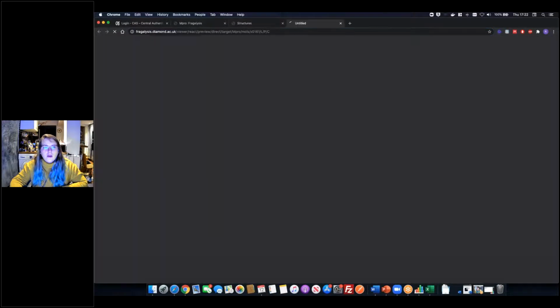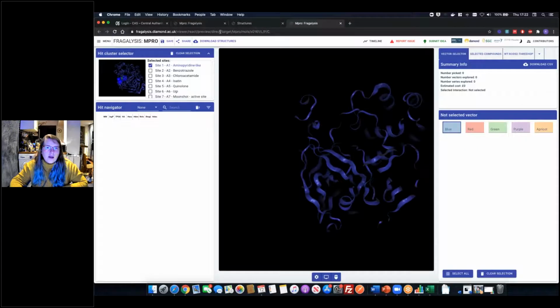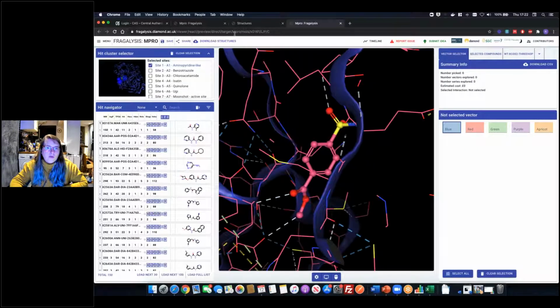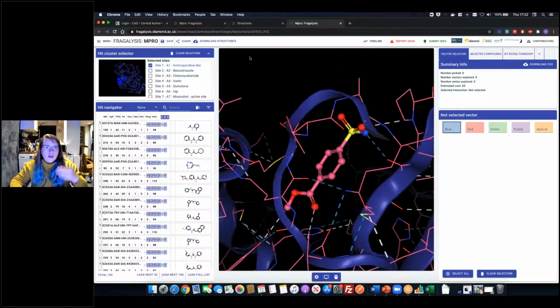If we click on one of those links, it's using something called a direct link. These links focus on a specific molecule, for example. Here we're saying turn on the molecule that starts in X0161, turn on the ligand, turn on the protein, and turn on the contacts as well. So if you're worried about the data changing, but really what you're sharing is the ligands, you can access that through those example links.